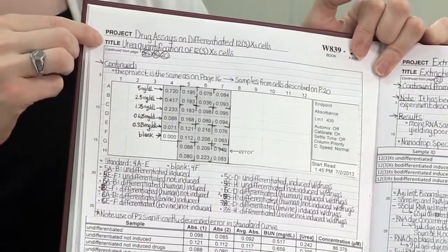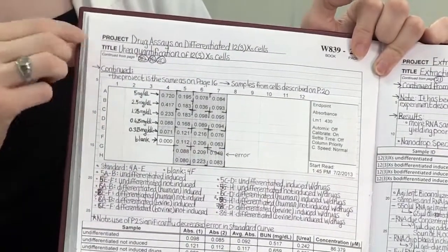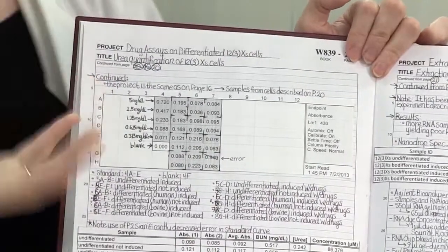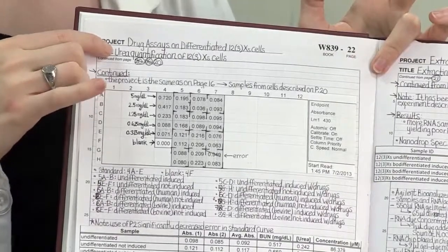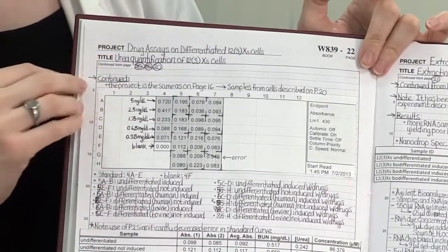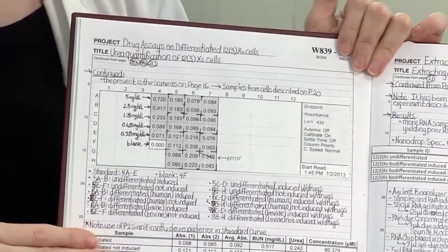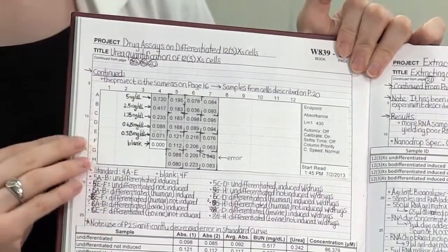It's also really important to have a detailed title that will help you remember what you did at a glance. I like to talk a little bit about what technique I'm doing in that section as well as what cell type I'm looking at and so forth.